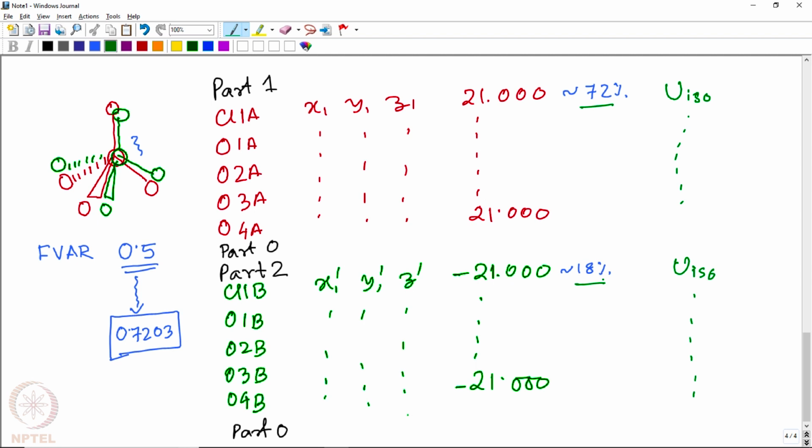So once with isotropic refinement we have converged to the least square refinement convergence, then one should do anisotropic refinement and get that U iso converted to those 6 anisotropic thermal parameters.